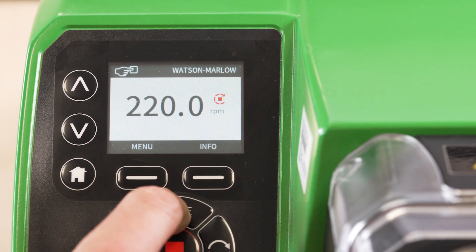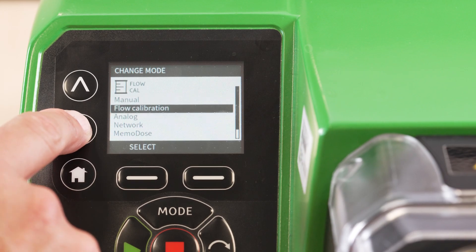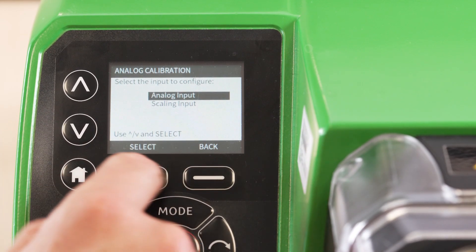Select mode. Navigate using the arrows to analogue mode. Select calibrate. Choose analogue input.